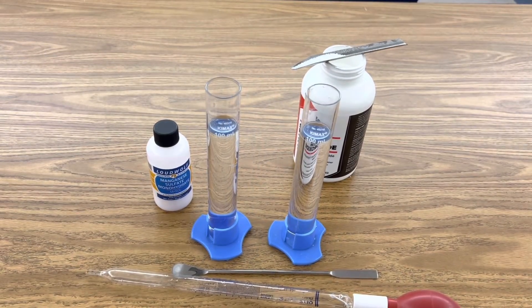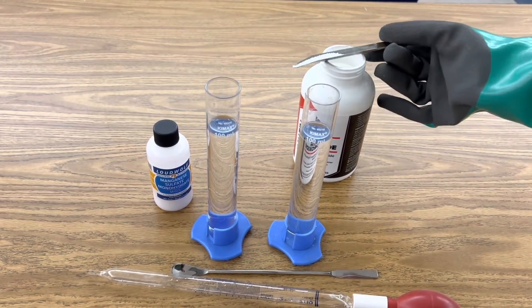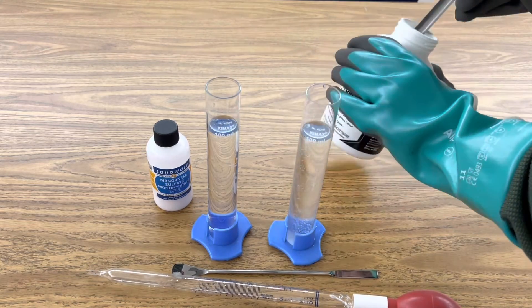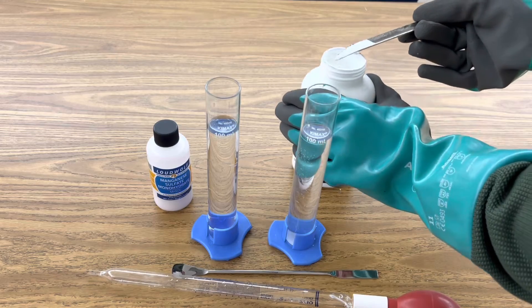Start by adding four grams of sodium hydroxide to 100 milliliters of distilled water, and stir your solution until it becomes aqueous.